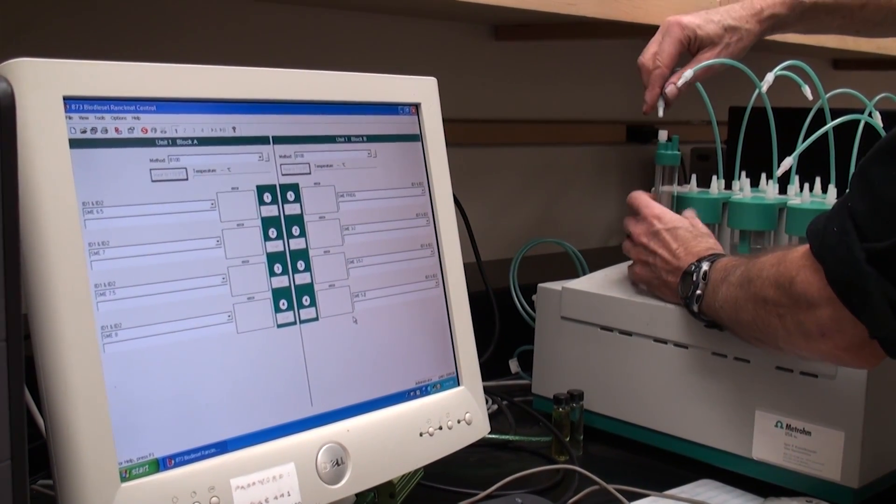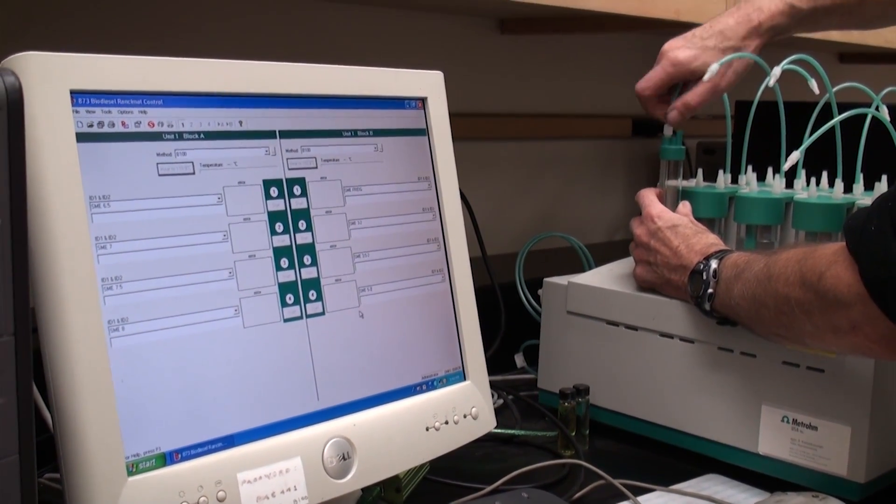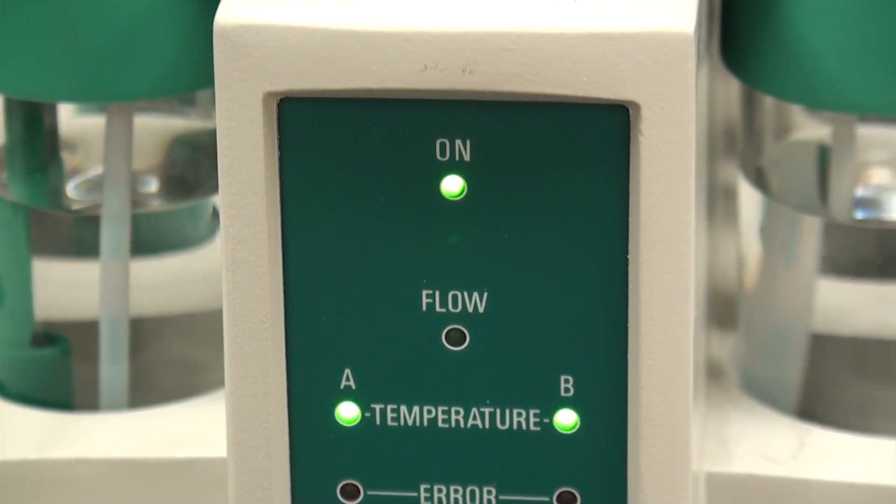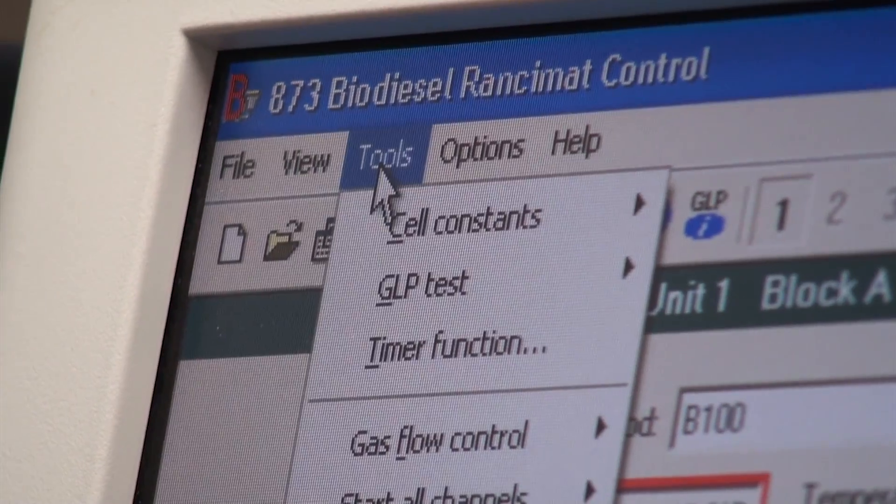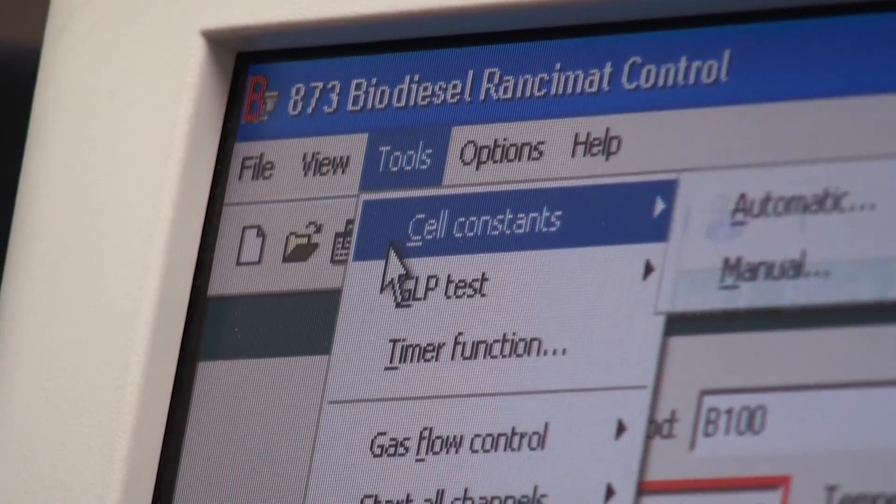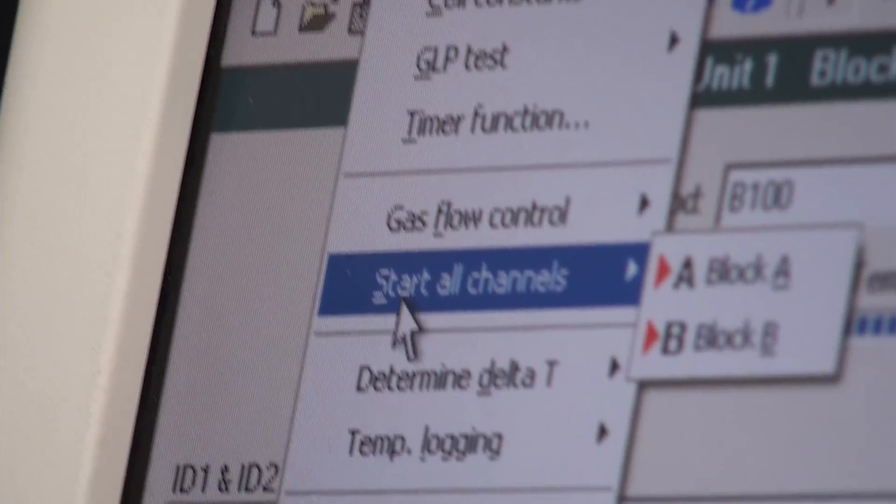So as the biodiesel deteriorates, the biodiesel breaks down, forms peroxides, they get swept into the water, and the conductivity will increase.